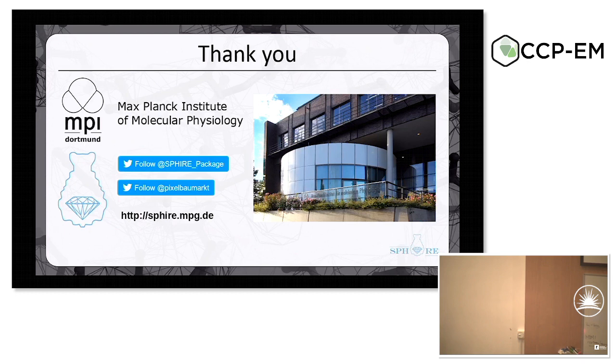So does crYOLO have problems picking particles with low contrast and low defocus, low molecular weight? No. What I can tell you from our experience in our lab and what other users are telling me, no, crYOLO has not a problem with picking on low defocus images as soon as you provide training data. So it will probably not work if you only provide high defocus images to train. It will probably not work on low defocus images, but if you also provide some of the low defocus images in the training data, sure, it will work.